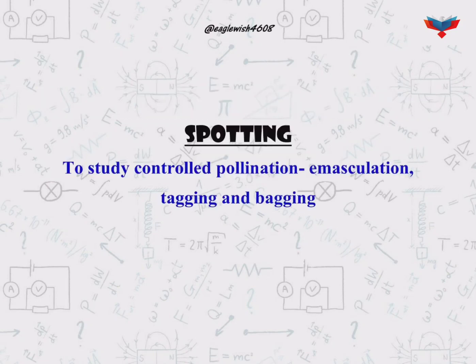The aim of the spotting is to study controlled pollination showing emasculation, tagging, and bagging.